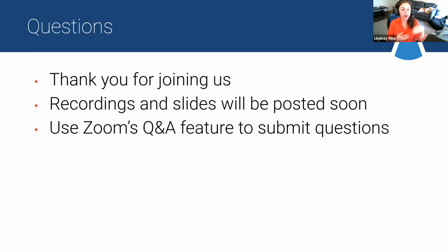Or if you're using IRTs spiked in, you can just set up those IRTs. Acquire with a DIA method and analyze your data. So it's set up exactly the same as you would do a PRM or an MRM. You just change the transition settings in Skyline to be a DIA workflow. So very, very easy to get it set up for DIA.